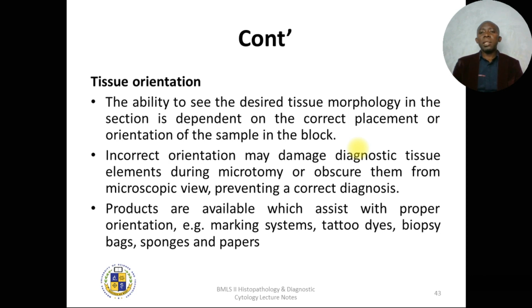So the ability to see the desired tissue morphology in the section is dependent on the correct placement or orientation of the sample in the block. Incorrect orientation may damage diagnostic tissue elements during microtomy or obscure them from microscopic view, preventing a correct diagnosis.